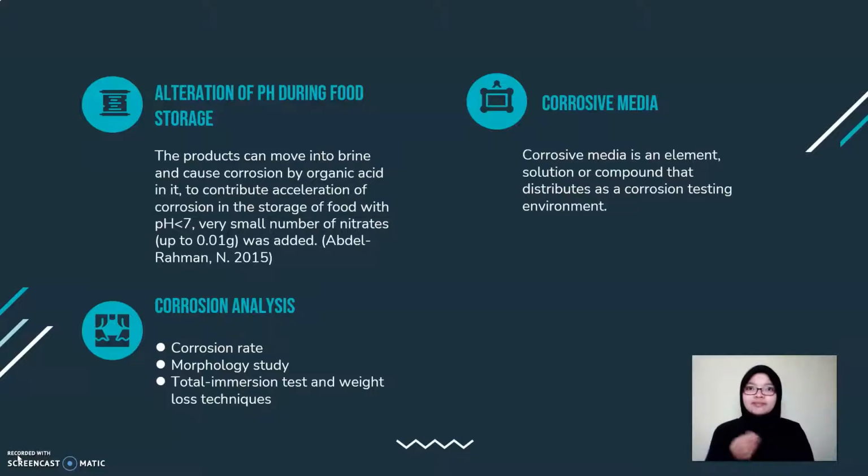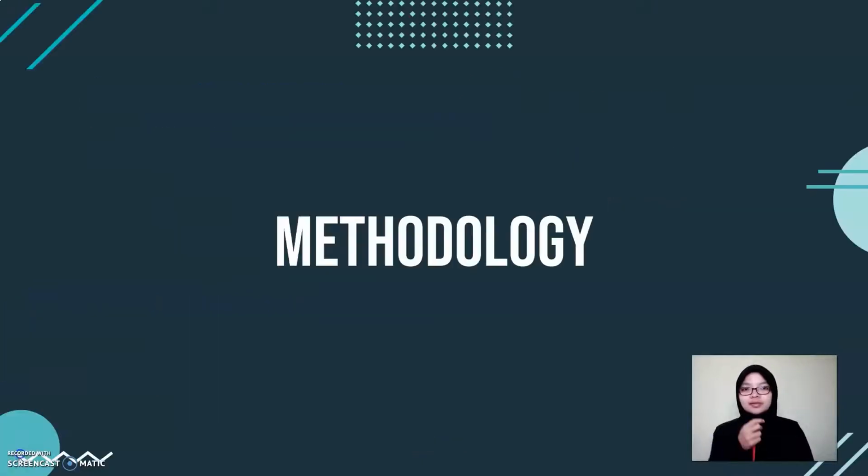Shape may mean either of these or it may refer to a structure, but it does not have a clear definition until one is defined. And weight loss techniques. Total immersion testing for corrosion studies evaluates how well the metal holds when totally immersed in water or other liquids. Immersion corrosion testing is used to assess the material's resistance to an aggressive aqueous environment.